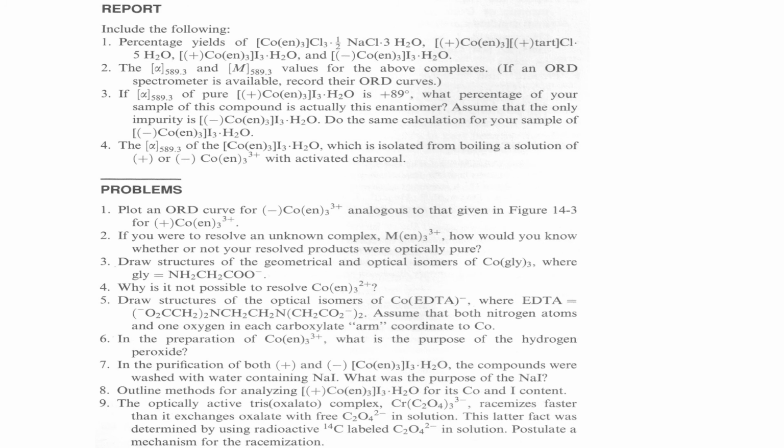Now the theoretical value is 89. You divide your optical rotation, for example, you got 75 or 80, by 89 times 100%, and you get the optical purity of your complex.